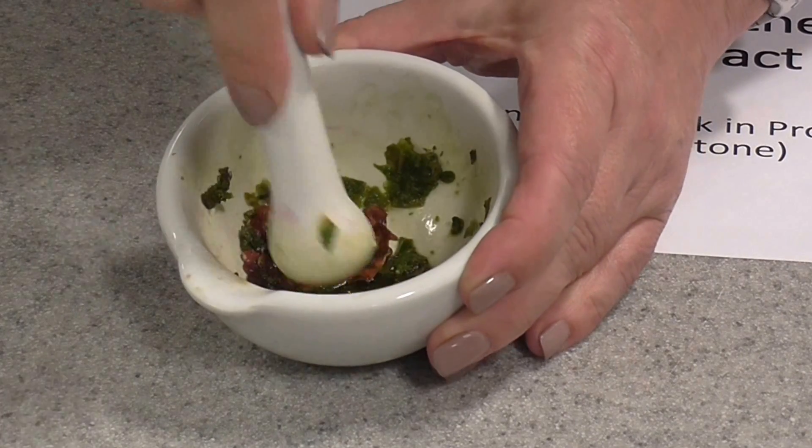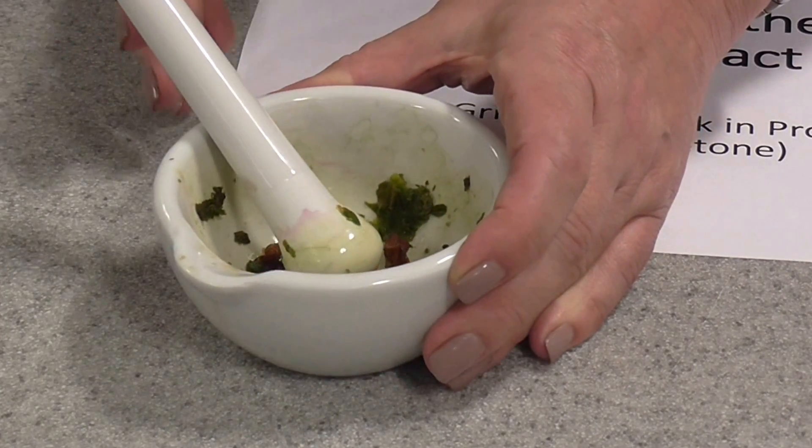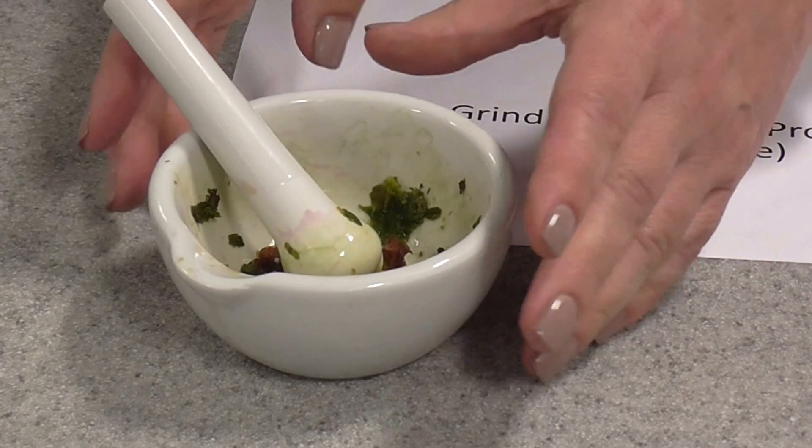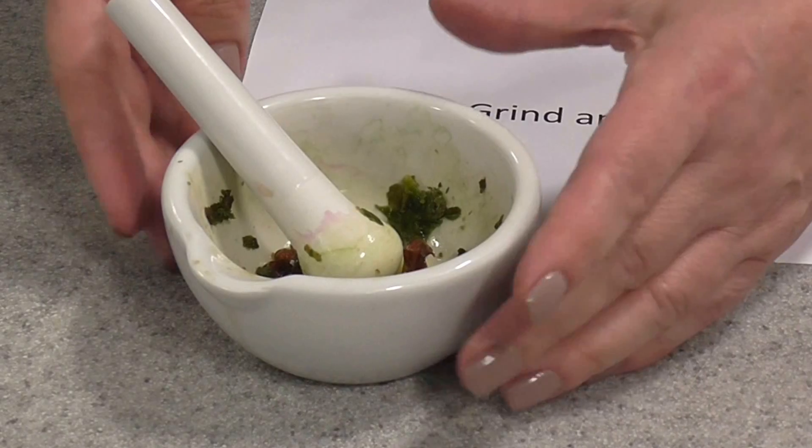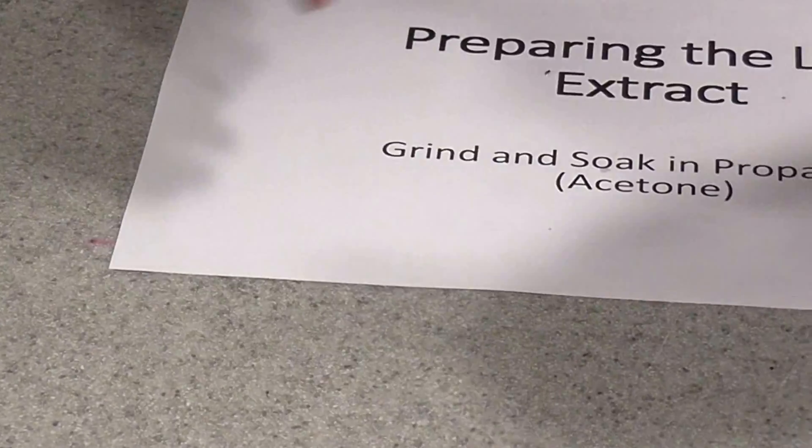Now, this does work a little bit better if you then leave that to soak for a few minutes. So it's a good idea to do that first, and then put that on one side while you prepare your TLC plate. So I'm going to put that out of the way for now.